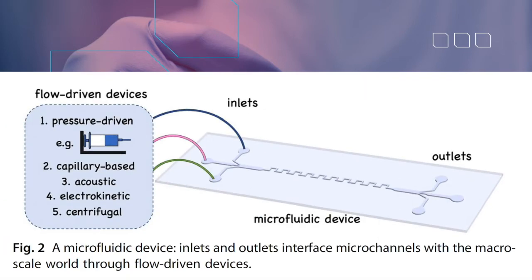This is an example of a microchip. Now, microfluidic devices also require other components additional to the chip, such as integrated pumps and valves, electrical fields, electrodes, and electronics to become complete diagnostic systems. This network of trapped microchannels is connected to the outside by inlets and outlets that are punched through the chip as an interface between the micro and the macro world.